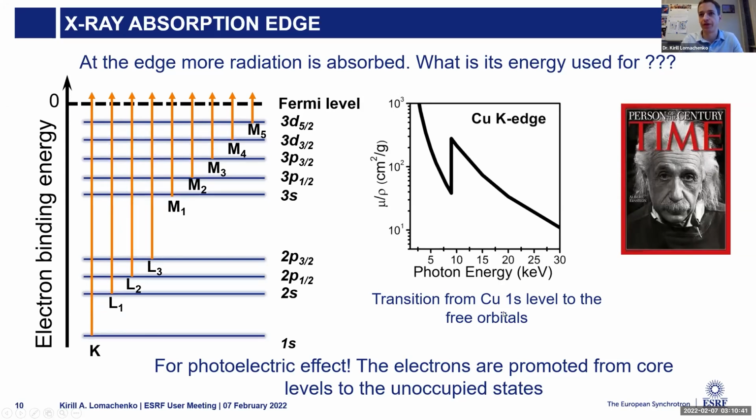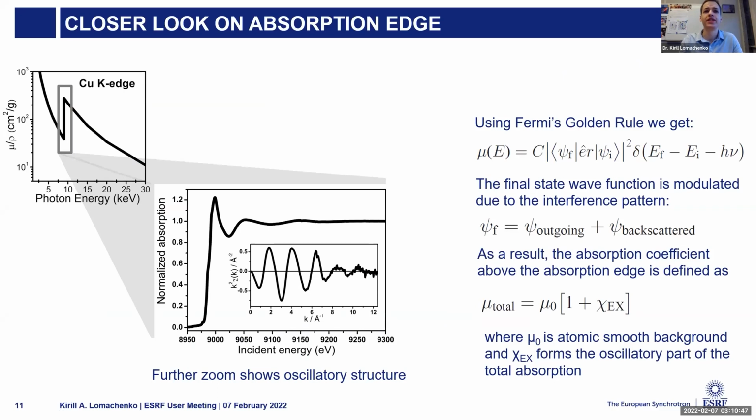Let's zoom in further into the edge. If we do, we see that it's not as simple as it looks, and the edge actually contains some structure.